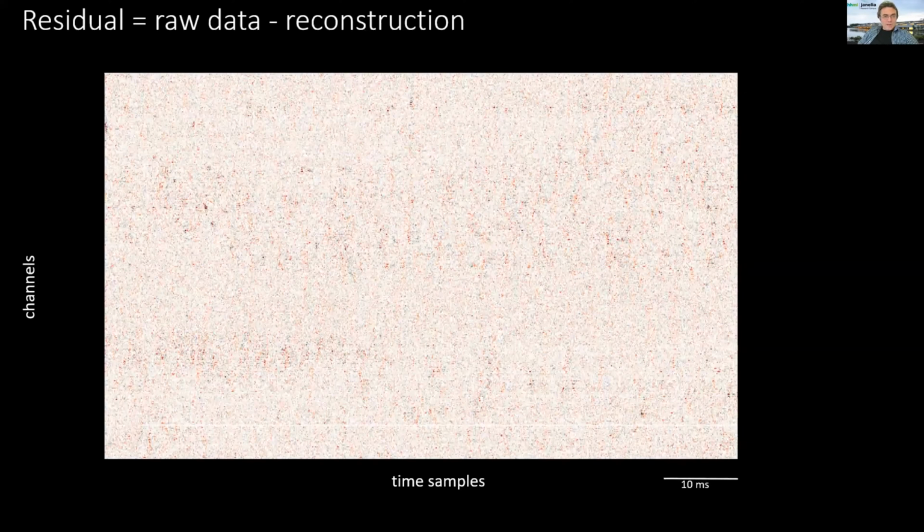And if we subtract those two images you saw before, you can see most of the events that were standing out just go away. And of course, making this residual as empty as possible of meaningful patterns is not only Kilosort's job, but is also a sign that it's doing a good job. So if you can still see spikes in here.